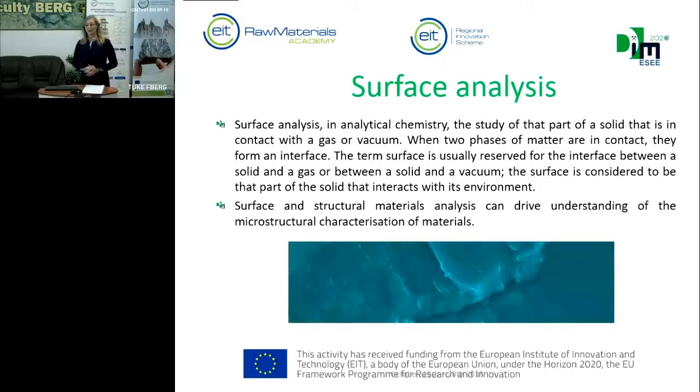X-ray photoelectron spectroscopy is a surface analysis. Surface analysis is a part of analytical chemistry which studies the part of a solid that is in contact with a gas or vacuum. When two phases of matter are in contact, they form an interface. The term surface is usually reserved for the interface between a solid and a gas or between a solid and vacuum. The surface is considered to be that part of the solid that interacts with its environment.